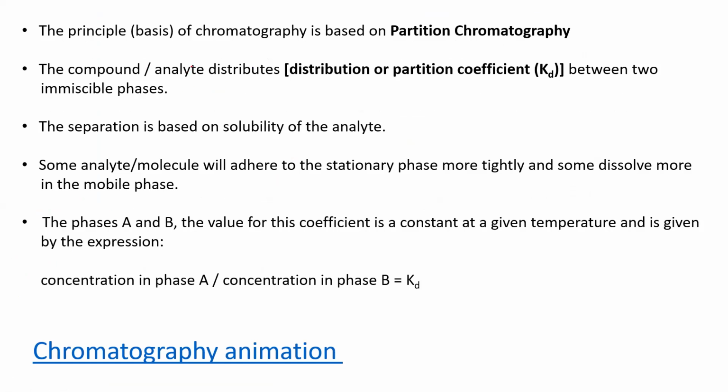Every analyte that you are going to separate can be a compound, a biomolecule, a drug, a nucleic acid, or any chemical compound, because these chromatographic techniques are also used in chemistry. A lot of things are synthesized in a chemical lab also. Some are naturally produced by bacteria and plants, but their analogs or similar compounds can also be chemically synthesized. So even chemistry uses these chromatography techniques like a biochemist would.